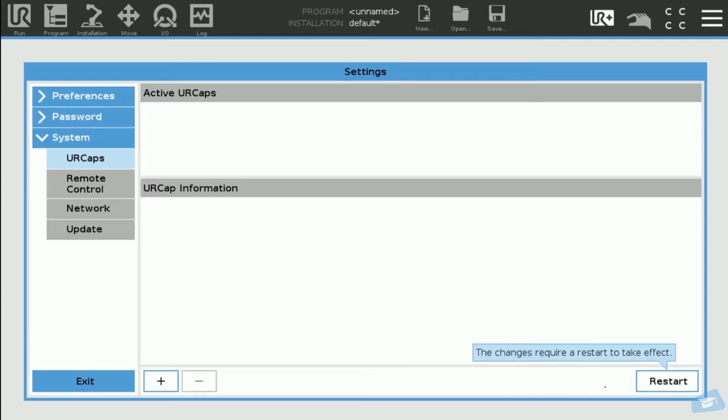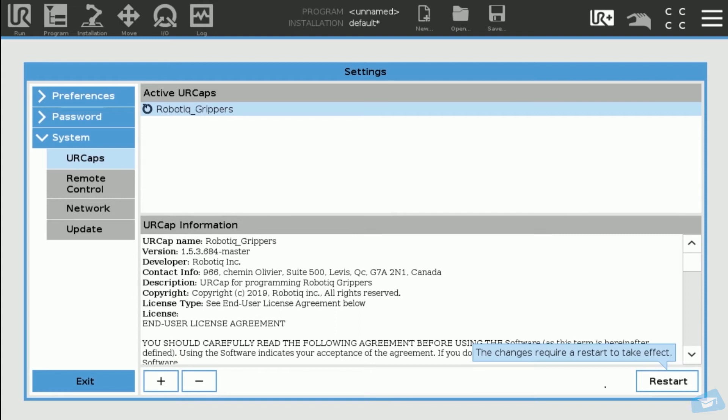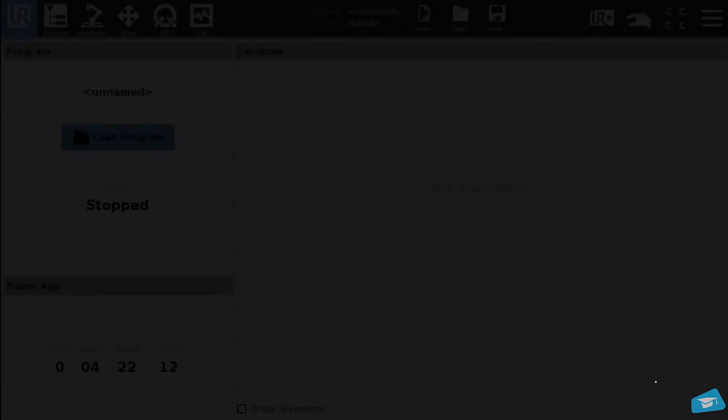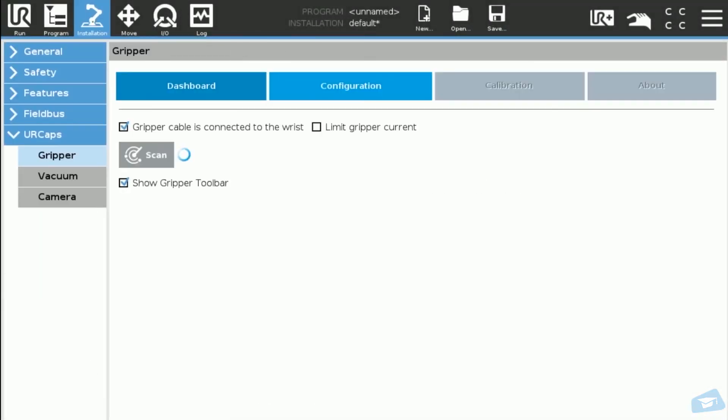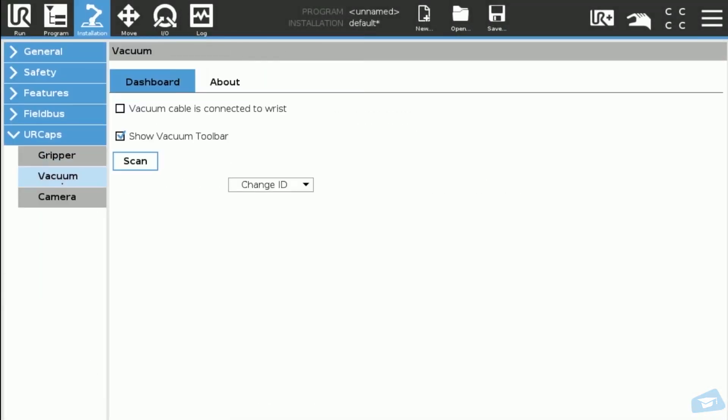Restart the robot software to complete the installation. In order to activate the Vacuum Gripper, tap the Installation button. Select the Vacuum button under UR Caps. Tick all the boxes indicating that the Vacuum Gripper is connected to the robot wrist.